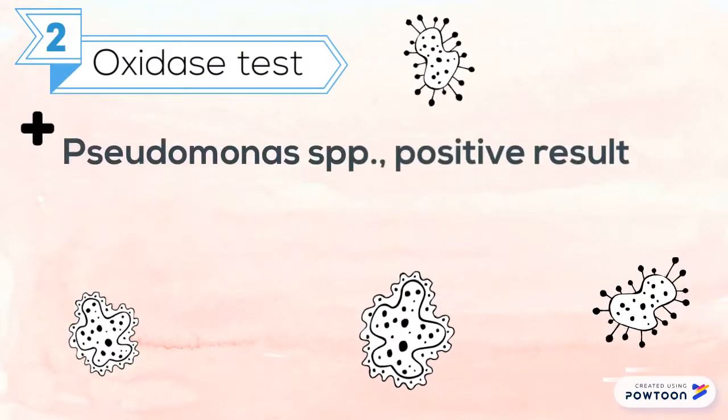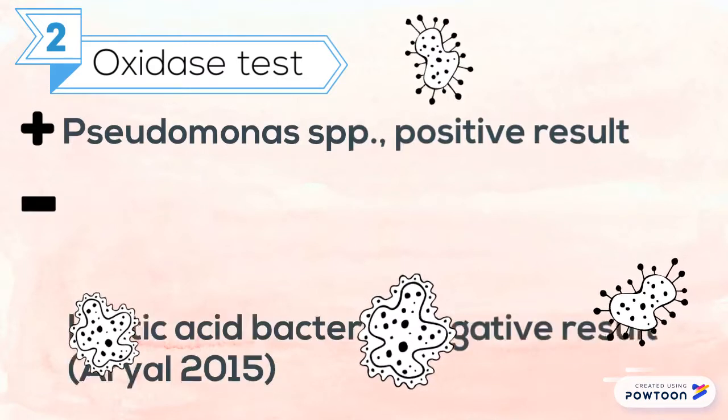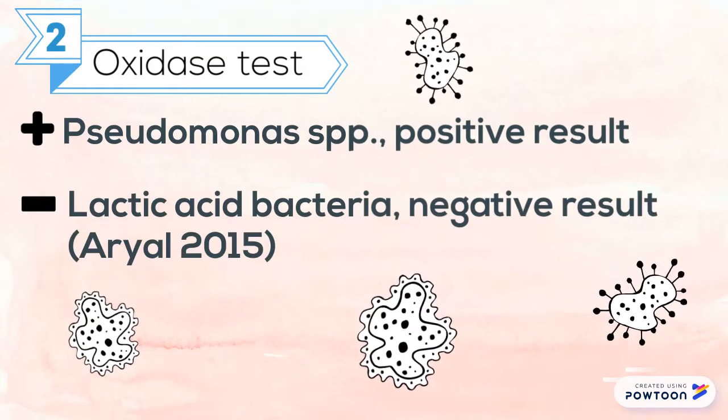It has been found that Pseudomonas species have a positive result towards this test, whereas lactic acid bacteria have a negative result towards this test.